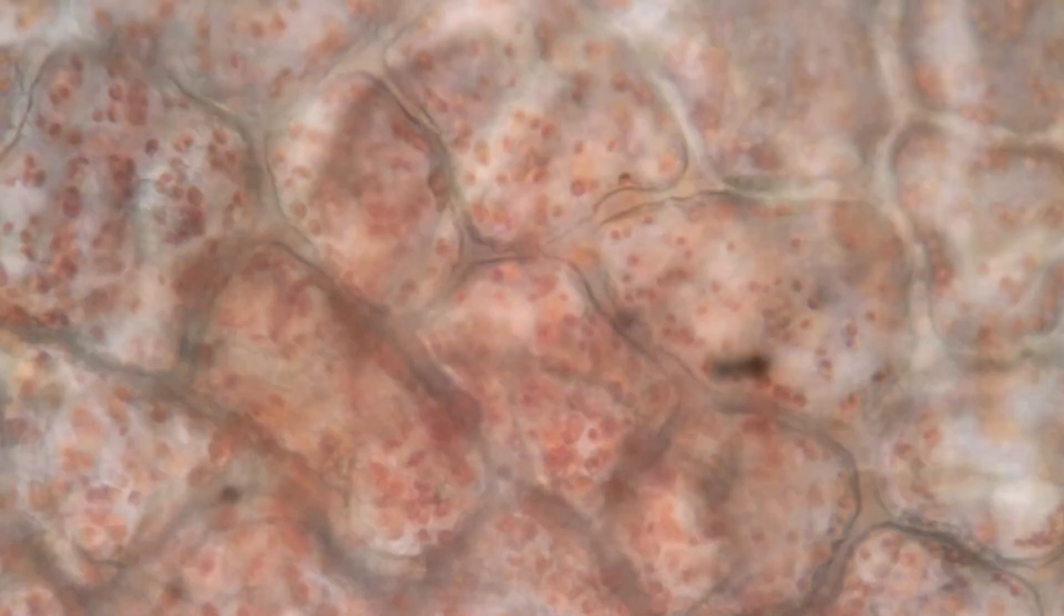A representative red pepper cell will have thick cell walls with clear plasmodesmata, small chromoplasts throughout the cell, and a visible circular nucleus.